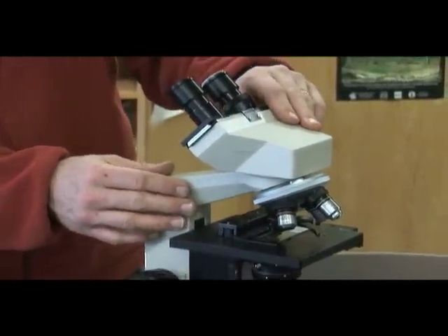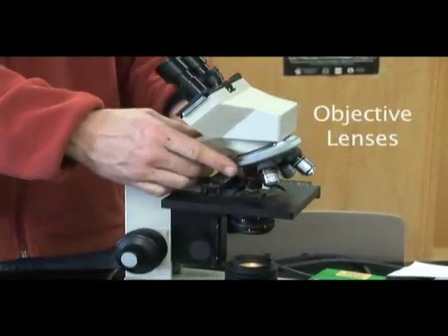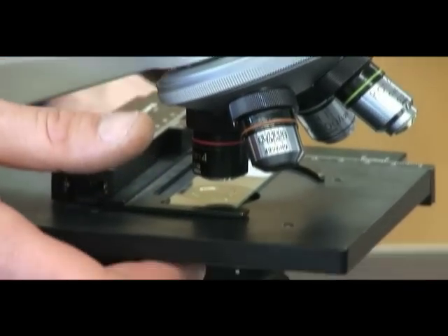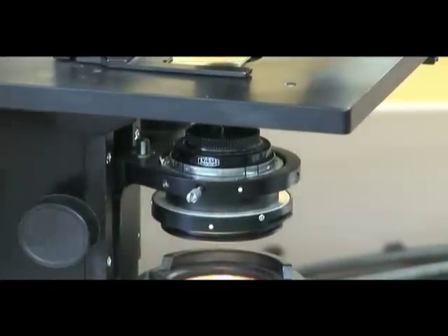If we move down from the ocular lenses to the nose piece, here you'll see the objective lenses. The objective lenses are closest to the object, which is an easy way to remember it. The next lens you'll need to know is the condenser lens. I'm moving the condenser down here with the condenser lens knob.